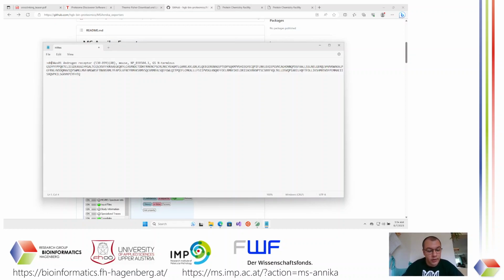I'm going to put the... okay, it doesn't let me type the pipe symbol on my keyboard.